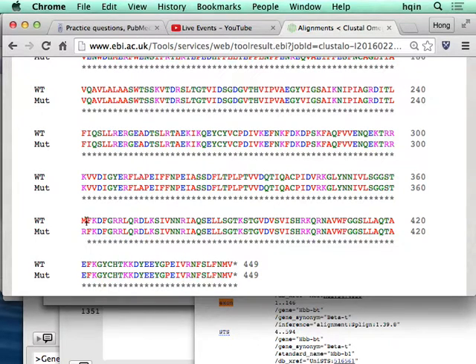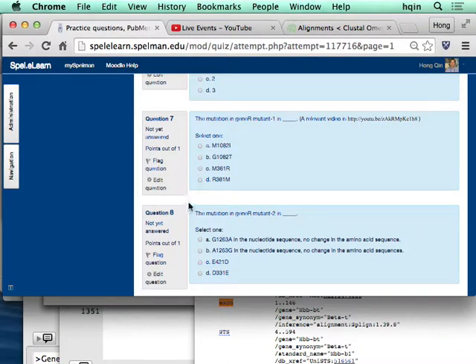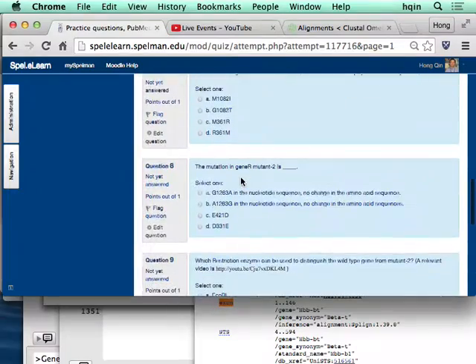There. That's the mutation right here. So 360, 361. So this is actually, we made it very easy for you. M361R. There, M361R. You make sure wild type at the left, mutant on right. So R361M would be a wrong one.